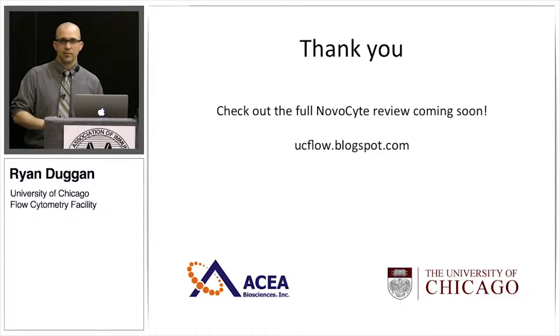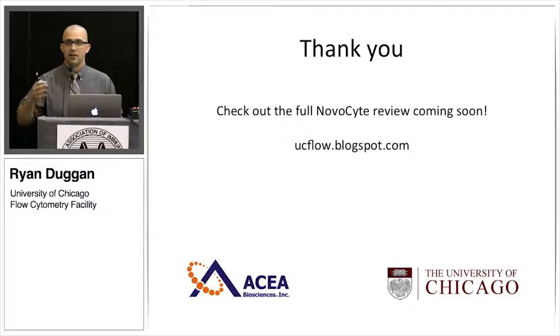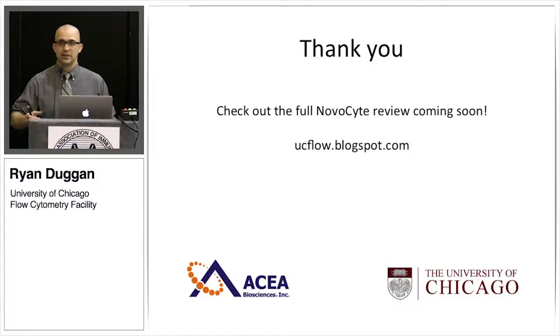Yeah, if I understand you correctly, you're talking about differences in baseline autofluorescence for different cell types or different states, like activated or not activated. Sure, exactly, and that could actually be a benefit. If you are only working with, say, macrophages, maybe that becomes your baseline from which you can calculate limits on that high autofluorescent population. The reason this can work is because the background is standardized to a specific phenotype, a specific cell type. It's not like I'm comparing activated lymphocytes on one day versus naive lymphocytes on the next day. That is all carefully controlled for from time to time.